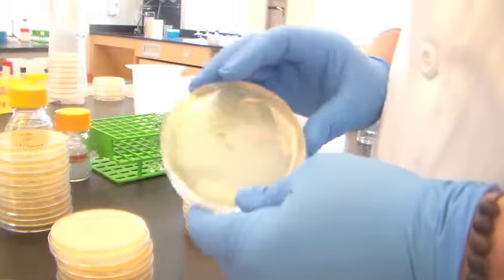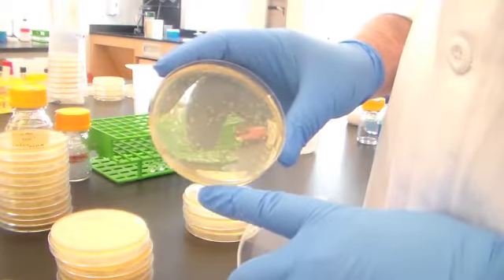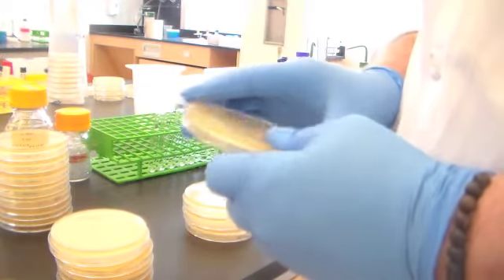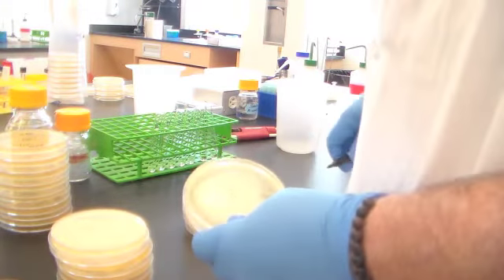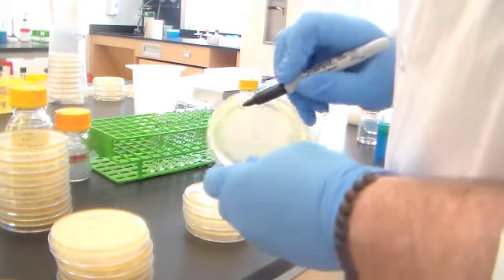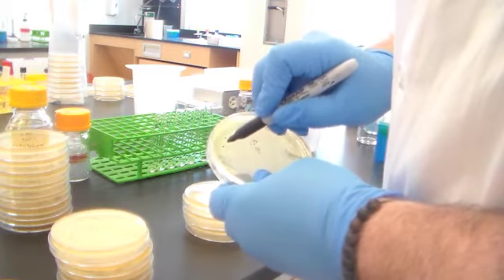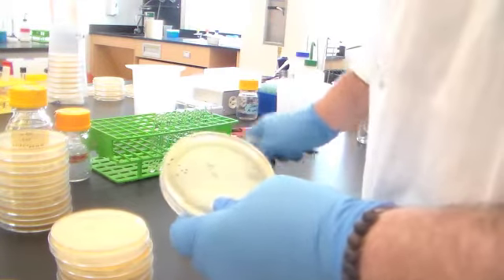10 to the minus 5, now we're getting someplace. Here, you could reasonably count the bacteria on that plate, and probably should. To make counting easy, because you will be doing this counting, and to make sure that you don't count the same colony twice, you're going to take a Sharpie, and as you count them, you're going to go 1, 2, 3, 4, 5, 6, 7, 8, and count an entire plate.